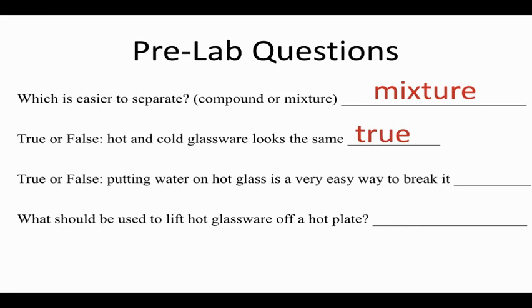Number 3, true or false? Putting water on hot glass is a very easy way to break it. This is also true. We want to ensure that all of our glassware has had the opportunity to completely cool down to the touch before we clean it with water.